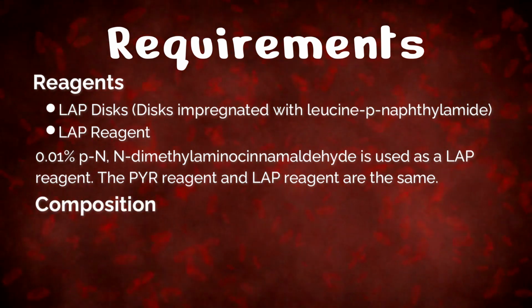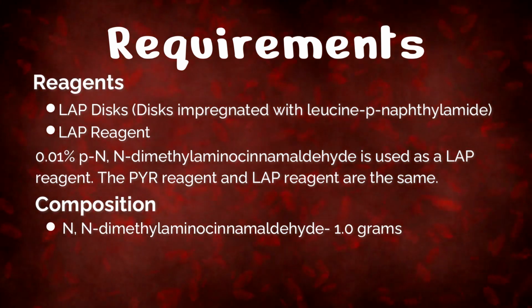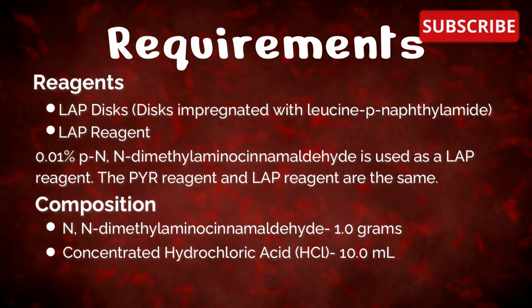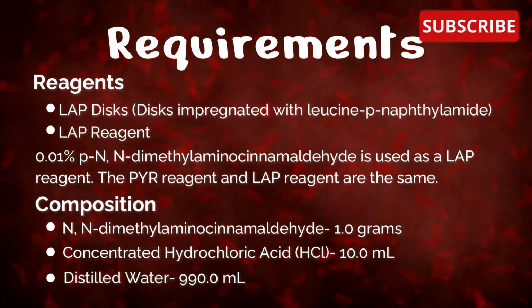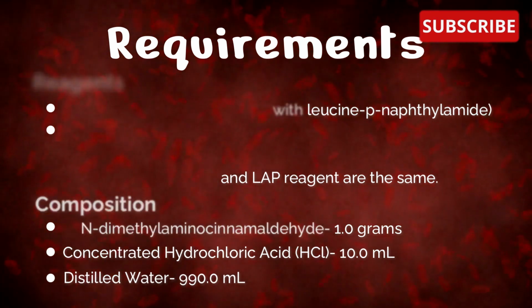Composition of the reagent: N,N-dimethylaminocinnamaldehyde is 1.0 gram, then concentrated hydrochloric acid, HCl, 10 ml. These all measurements are for 990 ml of distilled water.